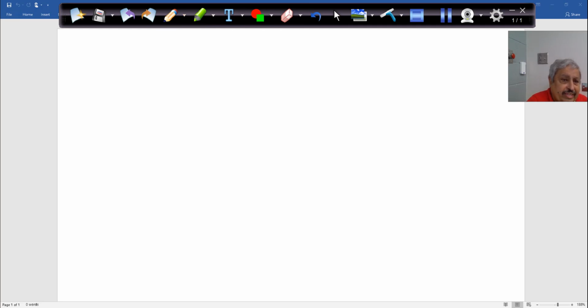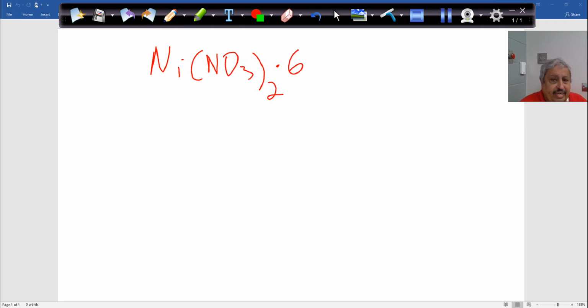I think we are taking nickel 2 nitrate hexahydrate. 6H2O means hexahydrate. Nickel 2 nitrate, because nickel has more than one charge. We'll make a certain concentration. That will be our stock solution.